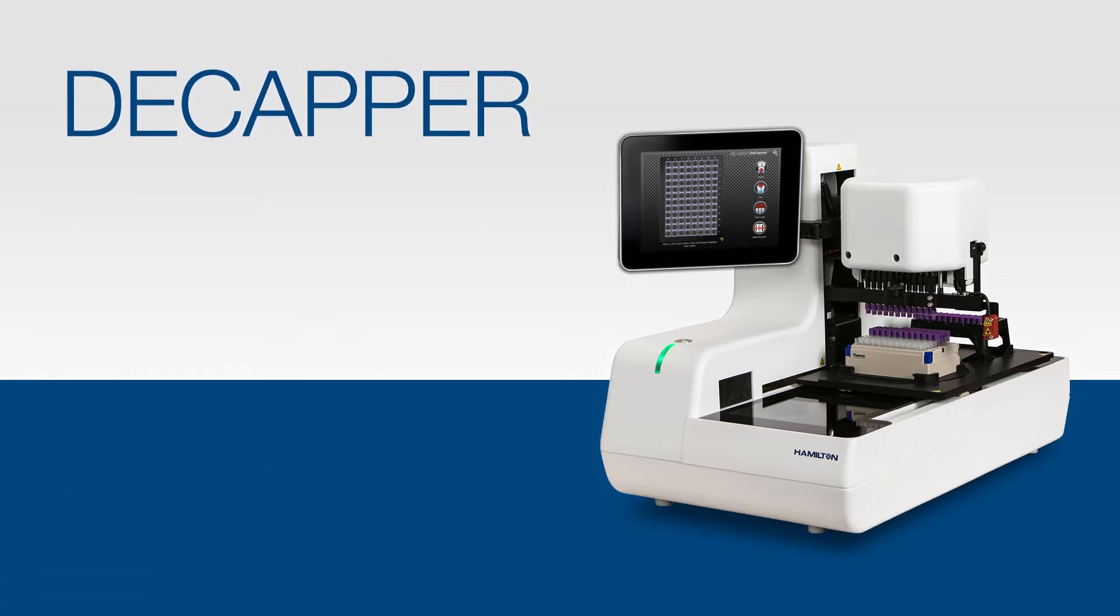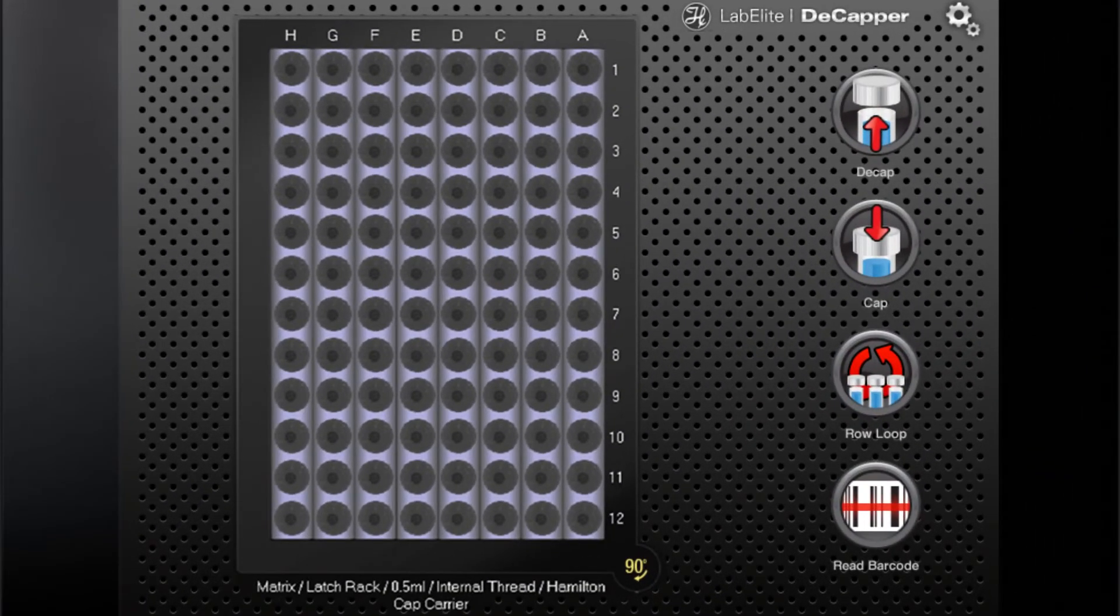Like all LabElite instruments, the Decapper is designed to be self-installed and easy to use. It comes validated with your labware types and ready to use right out of the box. The touch screen is simple with easily identifiable buttons like cap, decap, row loop and read barcode, which we will explain in detail later.